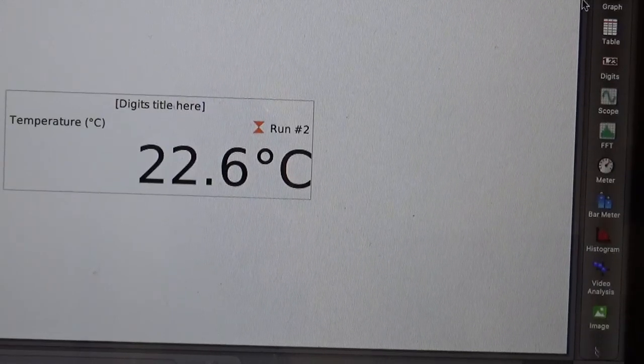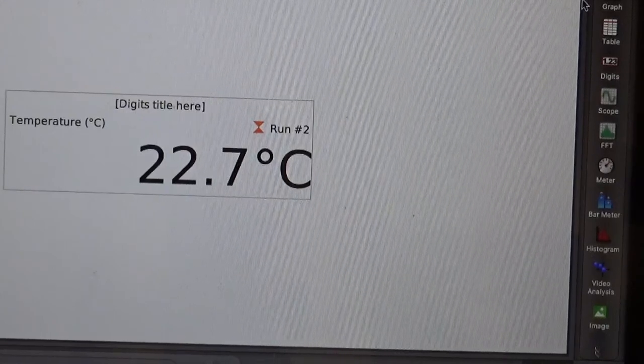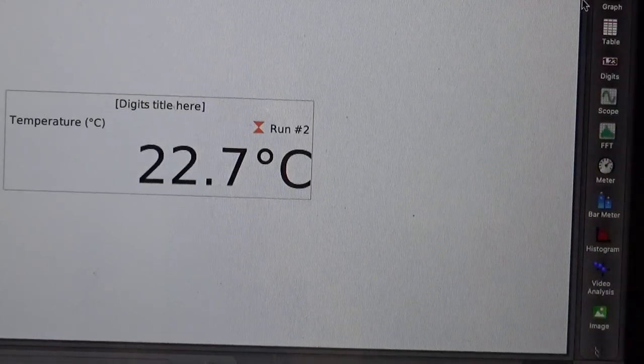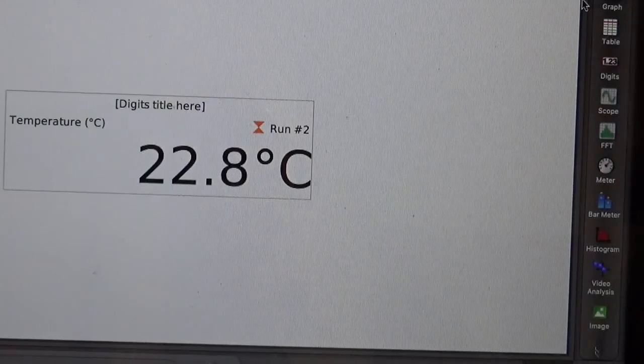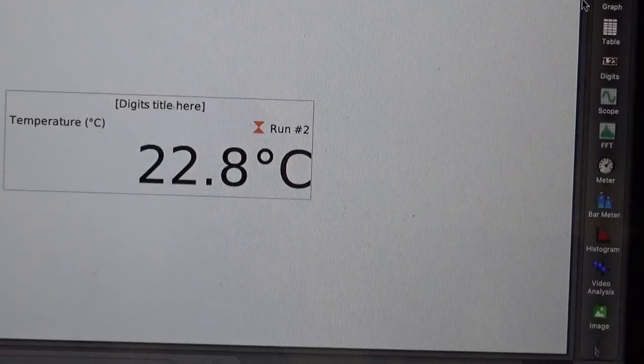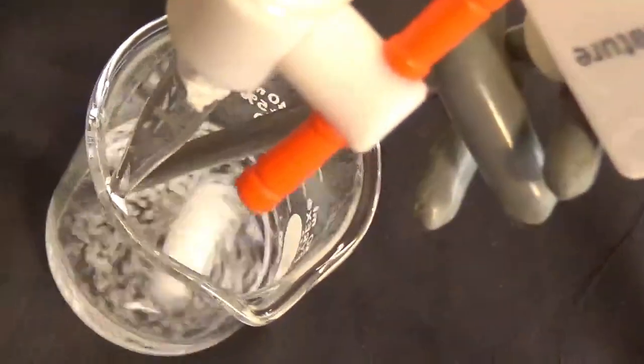I think I'm going to shoot it with a little bit more heat. We're on low. 1, 2, 3, 4, 5, 6. Turn it off. It should go up a little faster now, I hope. And still, you can see a lot of crystals.